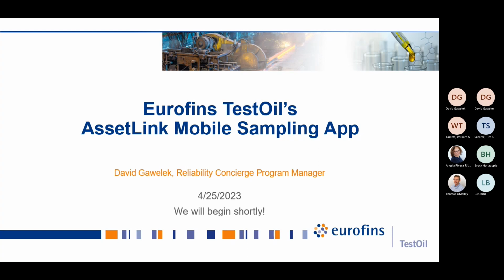And another feedback we received that was pretty significant was we would like to do everything digitally and paperlessly. So with those things in mind, efficiency, communication, and paperless, we've designed and rolled out our new version of AssetLink. This also, a happy accident of going paperless, helps us build efficiency into our own processes as far as processing samples goes, so we can maintain our same-day turnaround and focus on generating value and new products for you. So using AssetLink is a win all around.